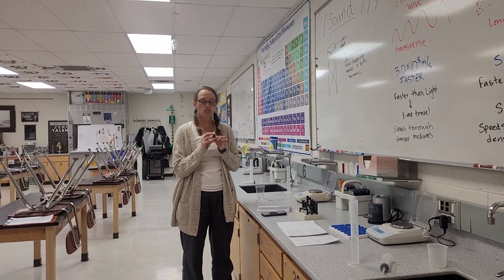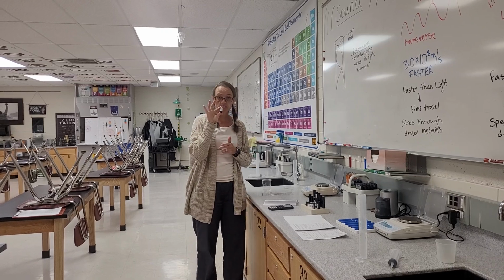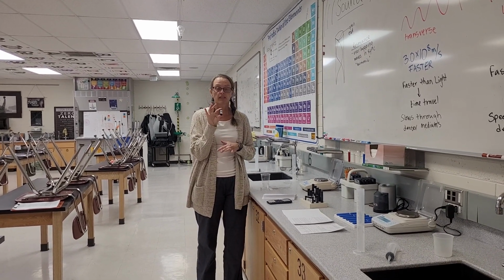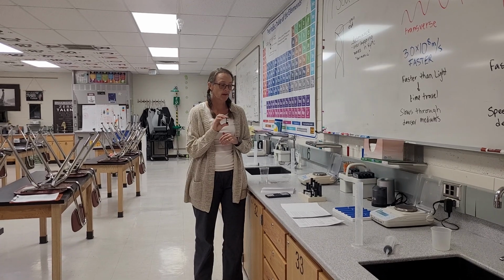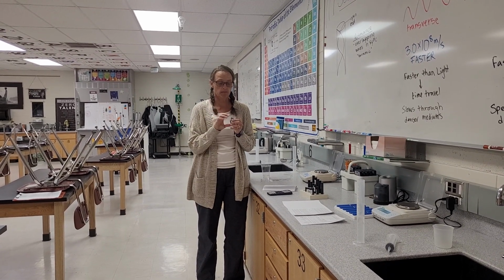All right, guys, I'm going to show you how to find the density of a cylinder. So you're going to pick up one of these objects. There's 12 different ones that you need to work through and do. Accuracy in your measuring is the most important part. So you're either going to do 12 of the blacks or the 12 blues. Okay, so that's important. Don't switch them up.